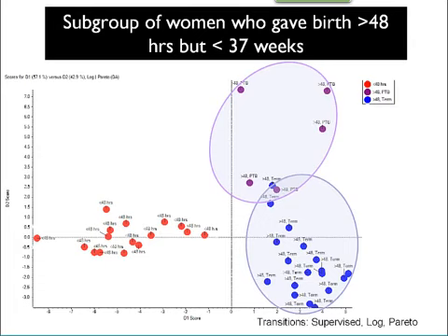There are markers that are indicative of preterm labor, not preterm labor, and sort of midterm labor. So all these are now candidates for formal assays that we can take back, go back into the clinic, take new samples from women and try and assay them. And then if we are fortunate enough that we can burrow into a mechanistic molecule or protein or group of proteins, then we'll have a bona fide biomarker test that'll be very useful to save a lot of money and, more importantly, improve public health.